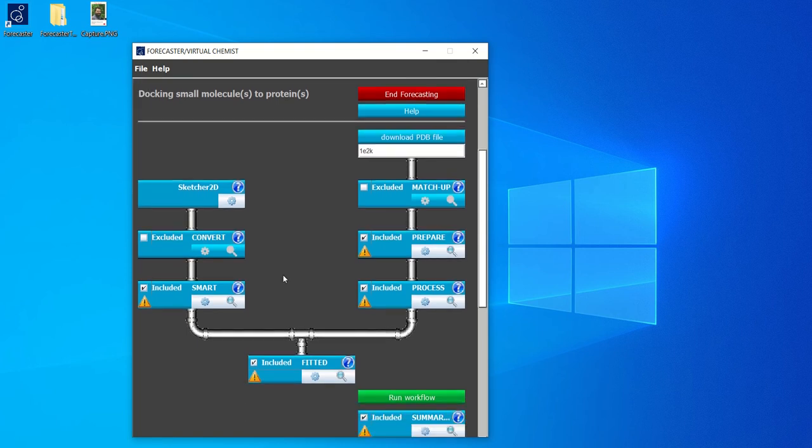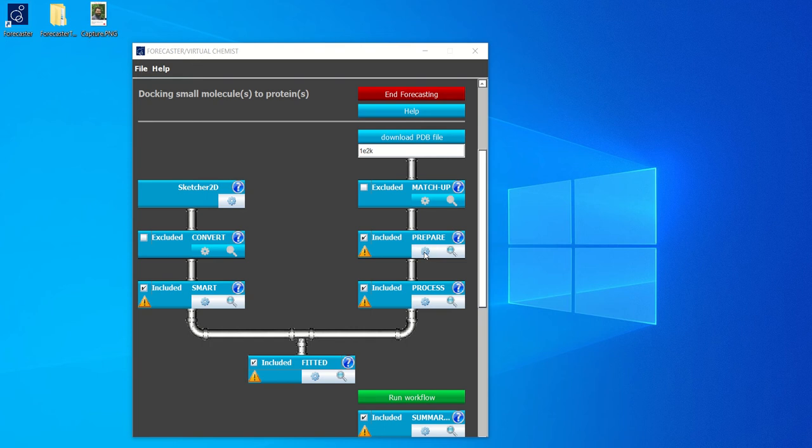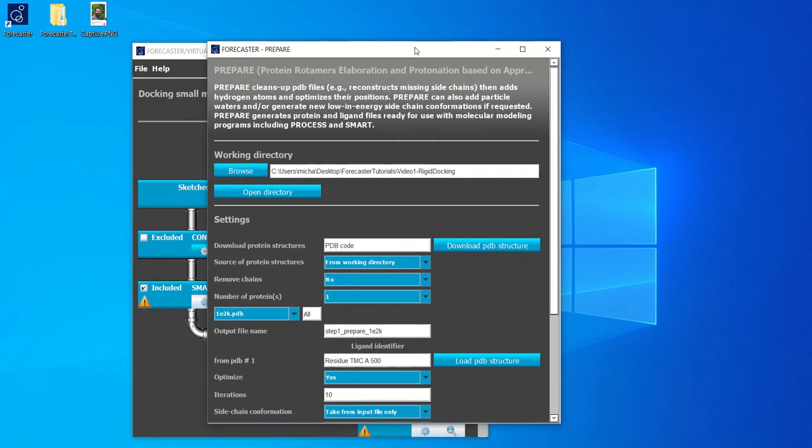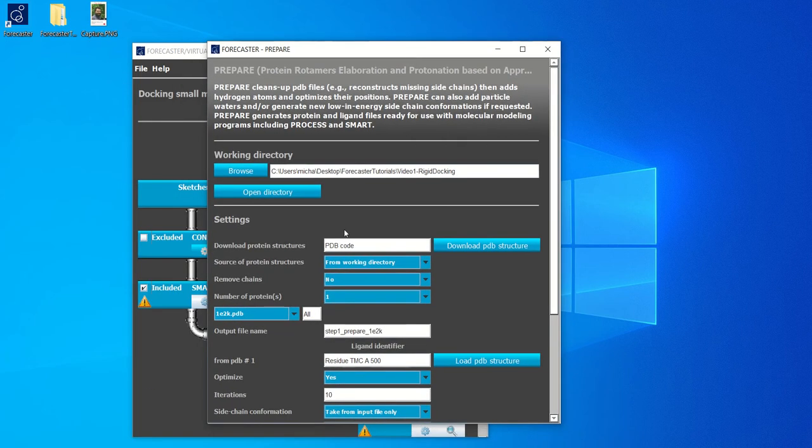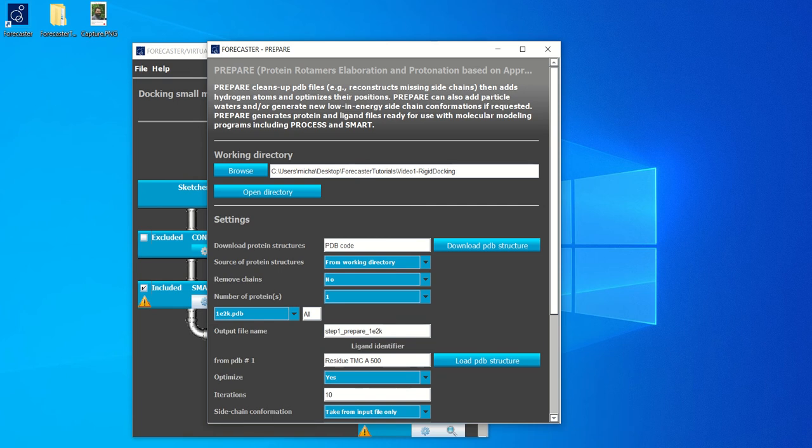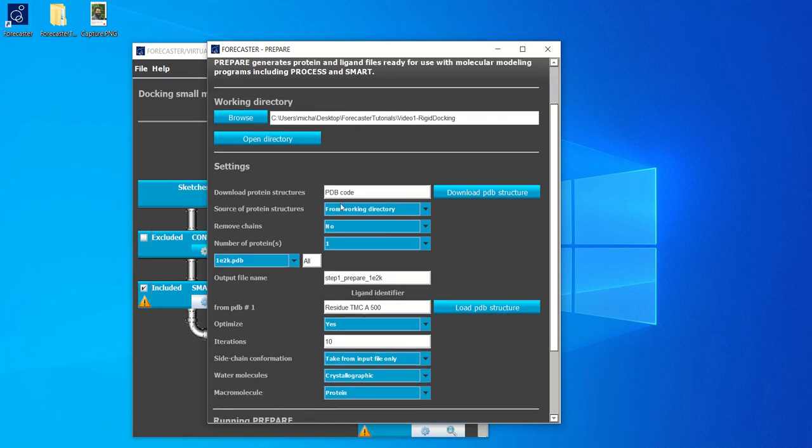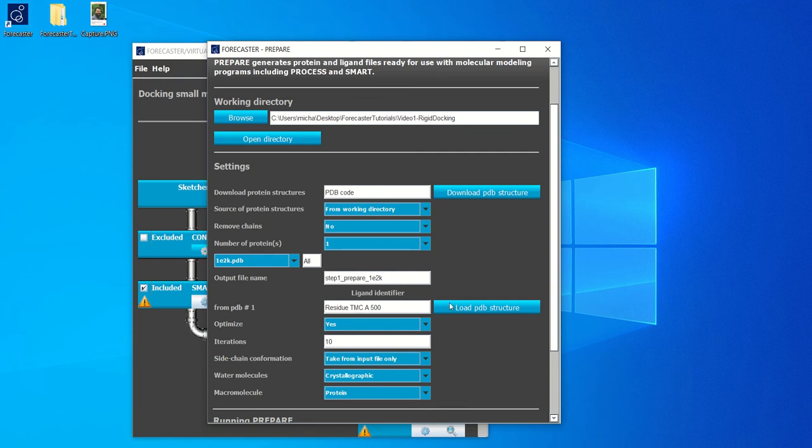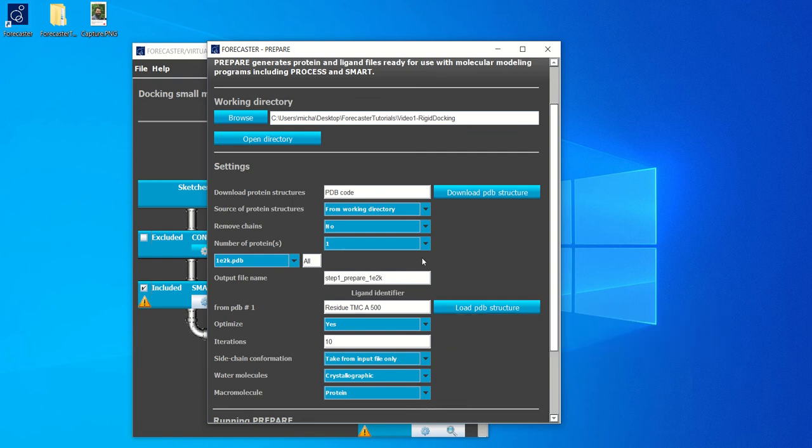There are three main steps to running a docking experiment with fitted. First one is prepare. Prepare is a module that takes a PDB structure and prepares it for docking by adding hydrogens, checking that amino acid side chains are correctly set up, as well as fixing different naming issues. And you will see that the interface here is quite easy to understand. It's self-explanatory.